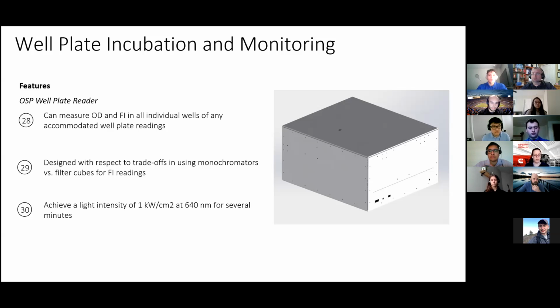In order to deliver well plates from the well plate incubator to the plate reader, the grabber arm is tasked with grabbing the well plate from the incubator and placing it on a retractable DVD disc-like tray which extends from the reader. The door features a self-closing spring hinge which opens up thanks to the force of the extending tray and closes again once the tray retracts.